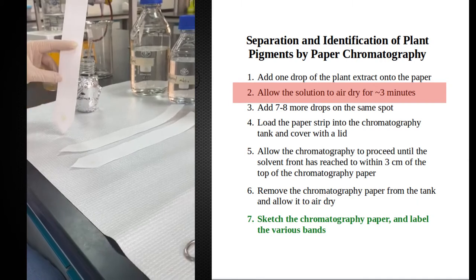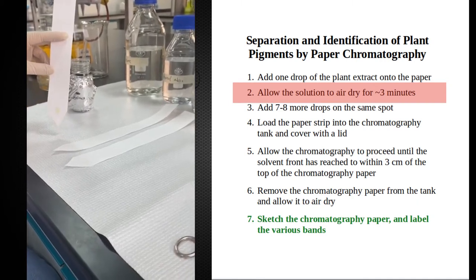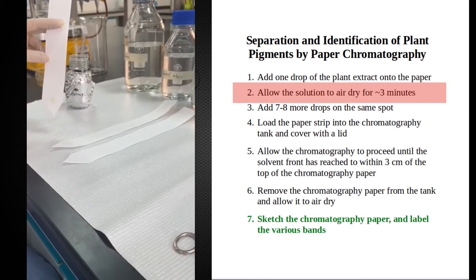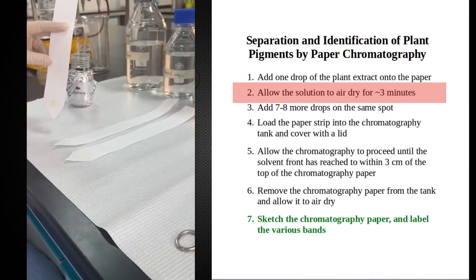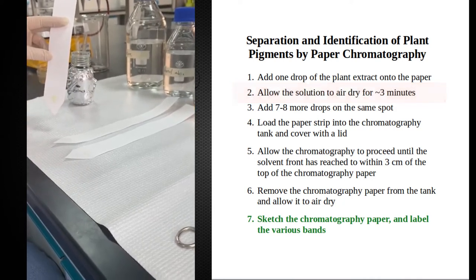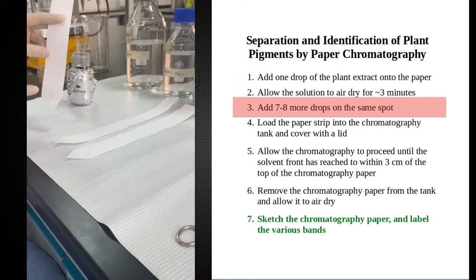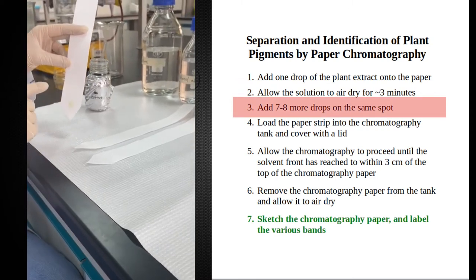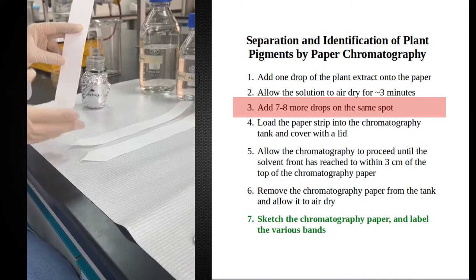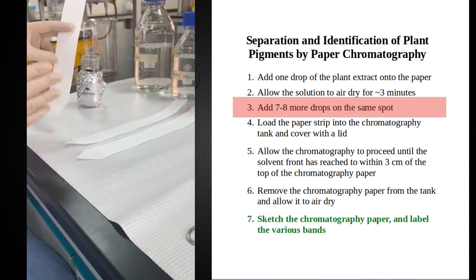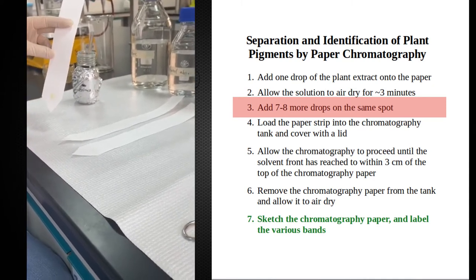We will see the separation toward the end. Now, one drop of the chlorophyll extract is not enough. I need to put different drops, but I need to wait until the chlorophyll is totally dry, then I put another point, then totally dry, then another point.